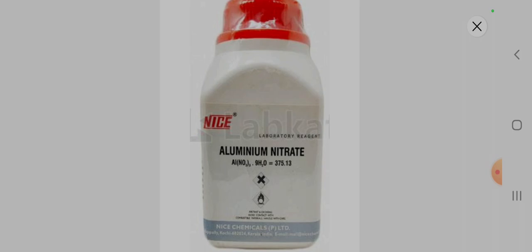If we require zinc nanoparticles, then we will be using zinc nitrate as the oxidizer. Here I am synthesizing the aluminium nanoparticles, so I am using aluminium nitrate as the oxidizer. It is the raw material for the final desired product, that is aluminium oxide nanoparticles.